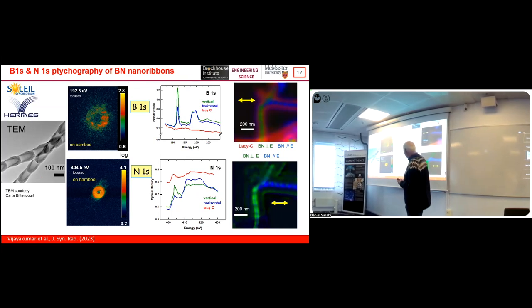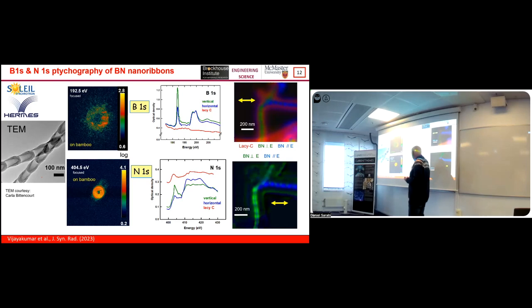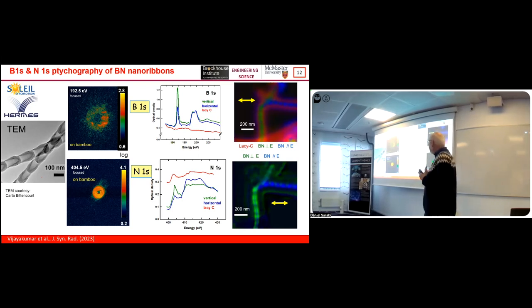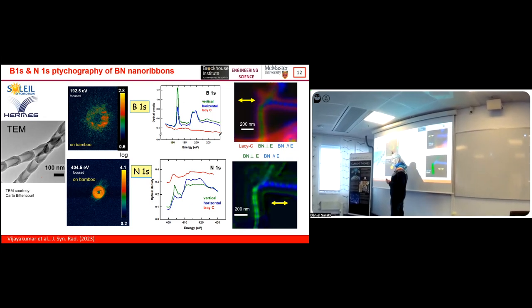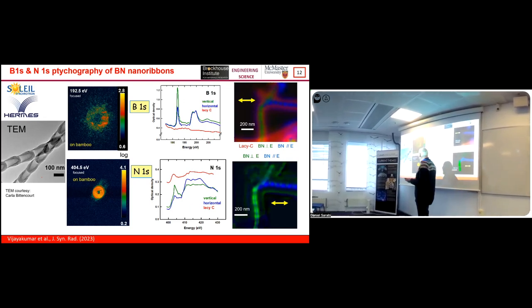If we look at the two peak energies, one is the pi star, the boron and the nitrogen edges. And you can see as you go to lower energy, the magnitude of the scattering, the range of it, is about an order of magnitude less. But in fact, there's really strong interaction there such that the annulus, which represents just the X-rays passing through the sample without any interaction, is barely visible here. All that speckle type signal right where the annulus should be. So you're really scattering everything.